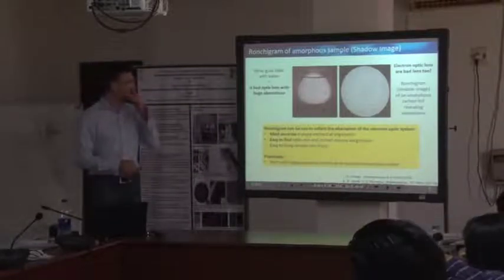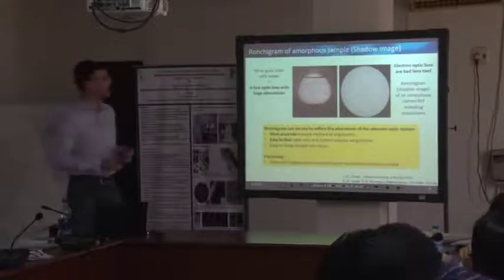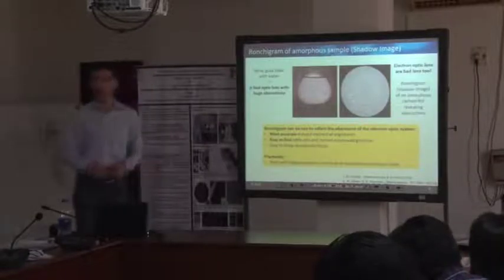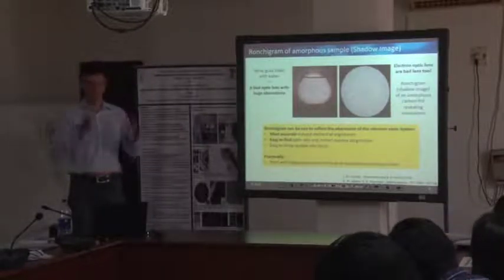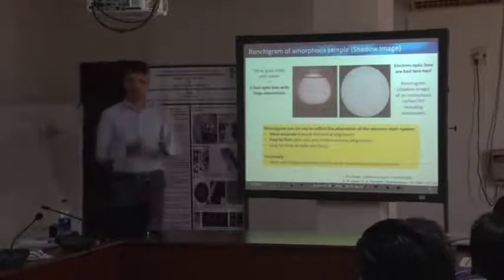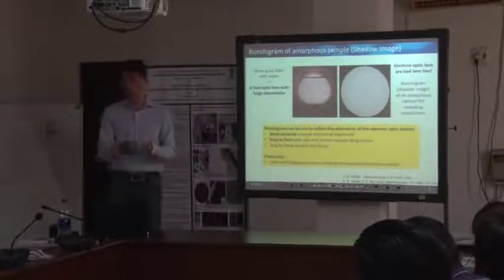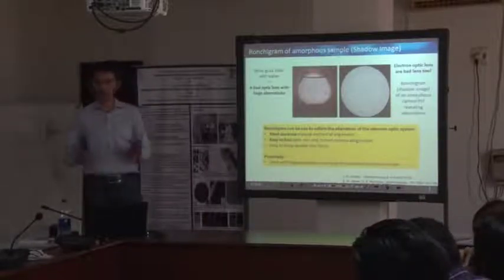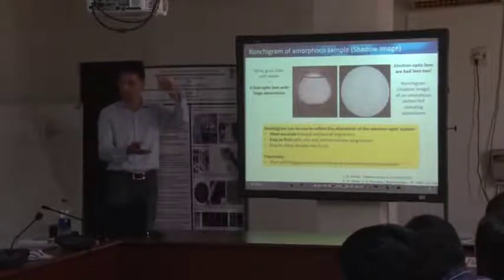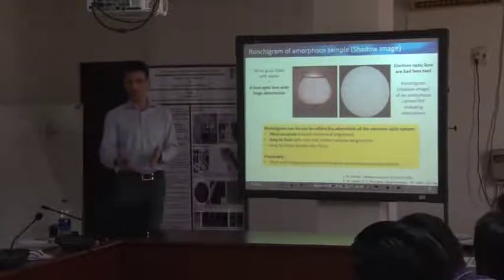The so-called Ronchigram is commonly used to either record it continuously with a CCD camera, or you just watch it using the small screen or the large screen, and then you can do all the alignments that you need for a perfect beam alignment. In principle, a perfect beam alignment means that your electron beam propagates parallel to the optical axis. It hits your sample at, let's say, 90 degrees, so it's not tilted, all those things. Meaning after the gun alignment, you do a proper condenser alignment, and finally you adjust the sample height and focus your probe onto your sample.